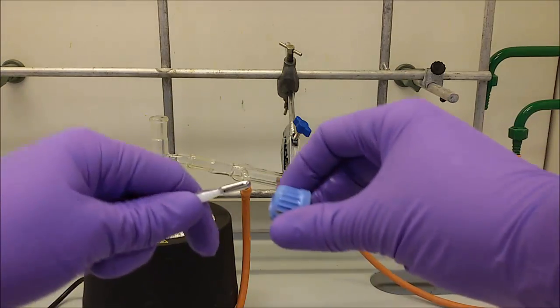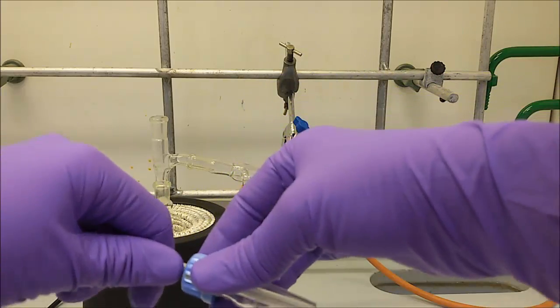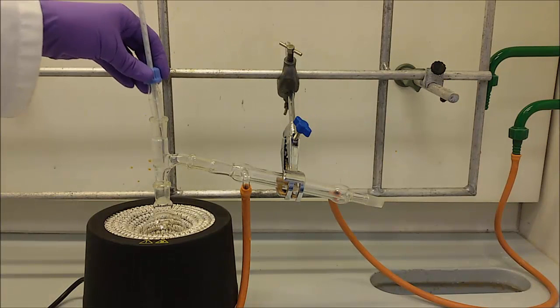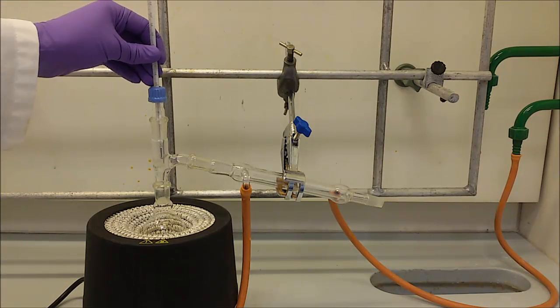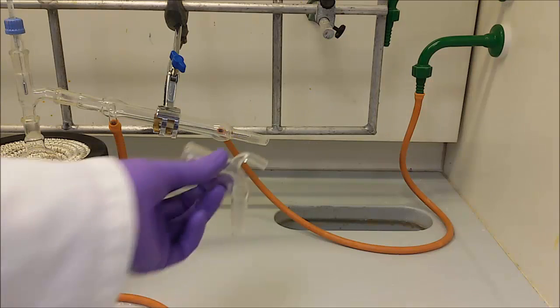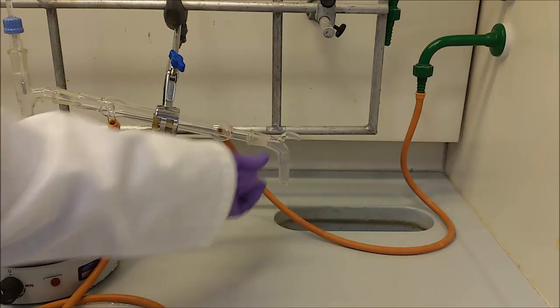Place the thermometer in the still head and the still head in the adapter. Adjust the thermometer position, so it was at the level of the vapors entering the condenser. Now place the receiving adapter and a beaker in which the condensed liquid will be collected.